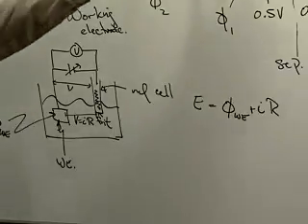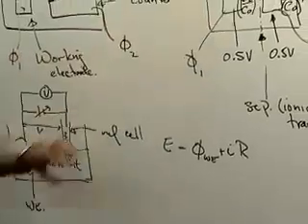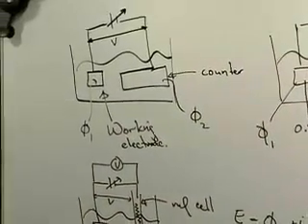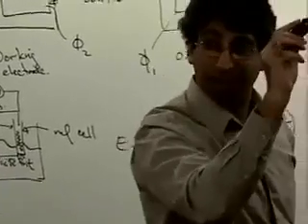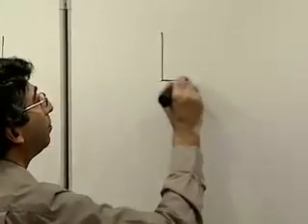This cell over here worked for zero period of time. Just right before the experiment was a good cell. This one's now working for a shorter period of time, but it's starting to work. And so we want to make our next modification now. We keep the freshman. That's very important, right? He's our feedback loop. So we have our cell.